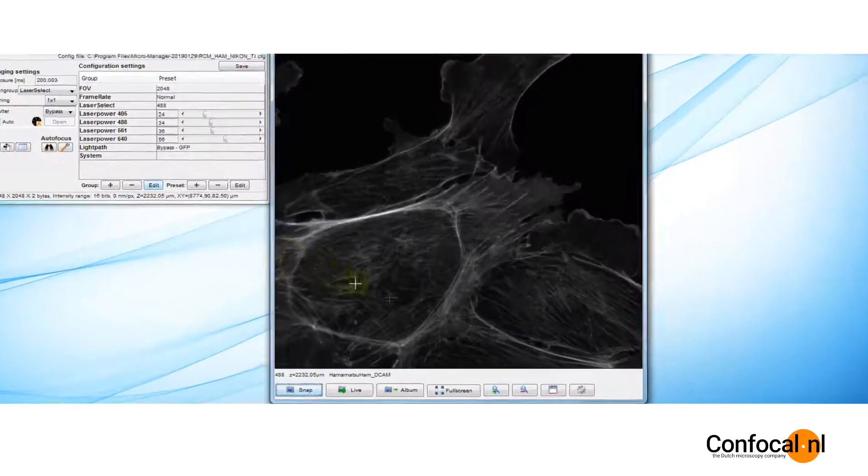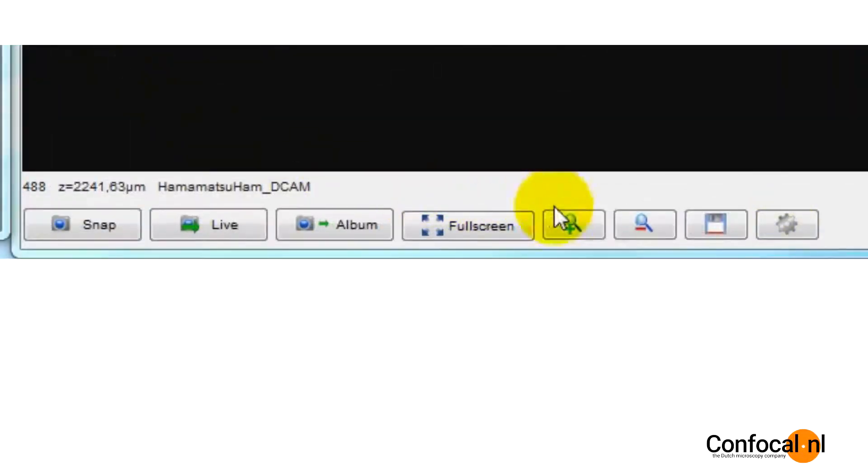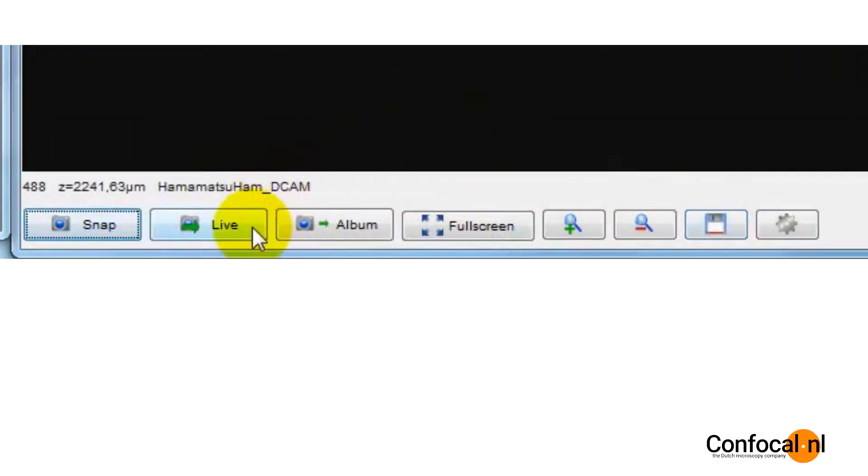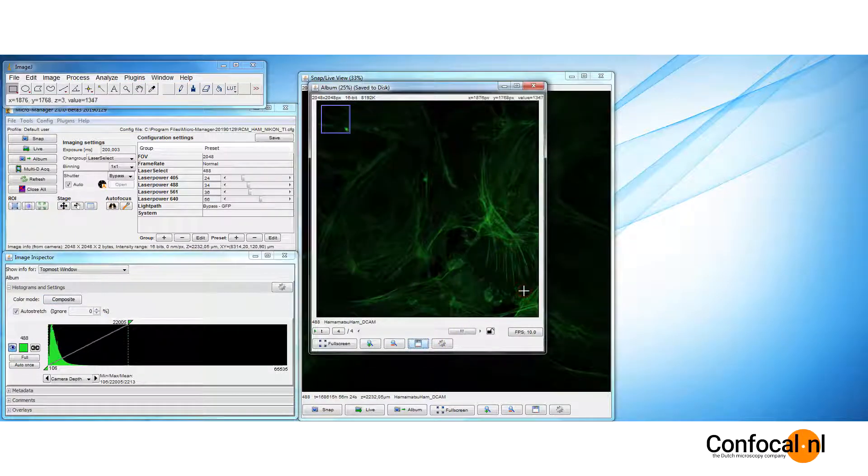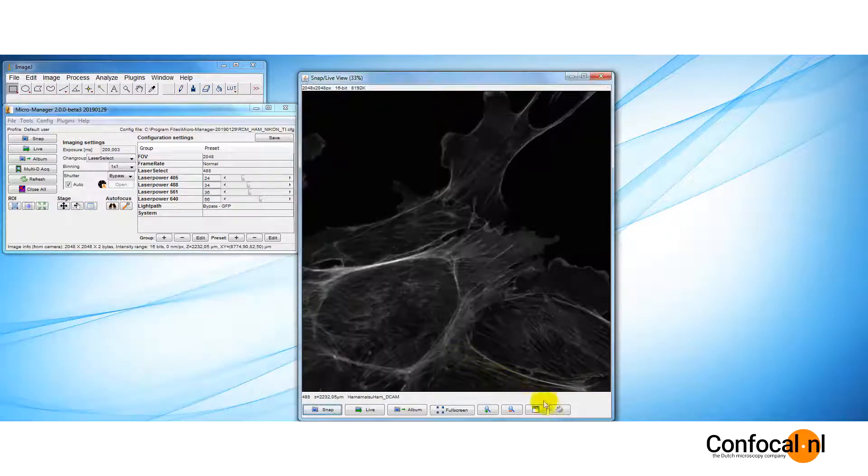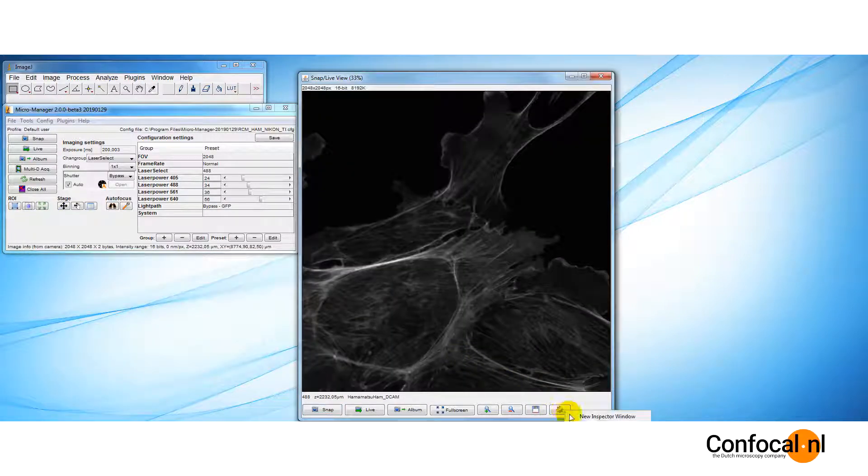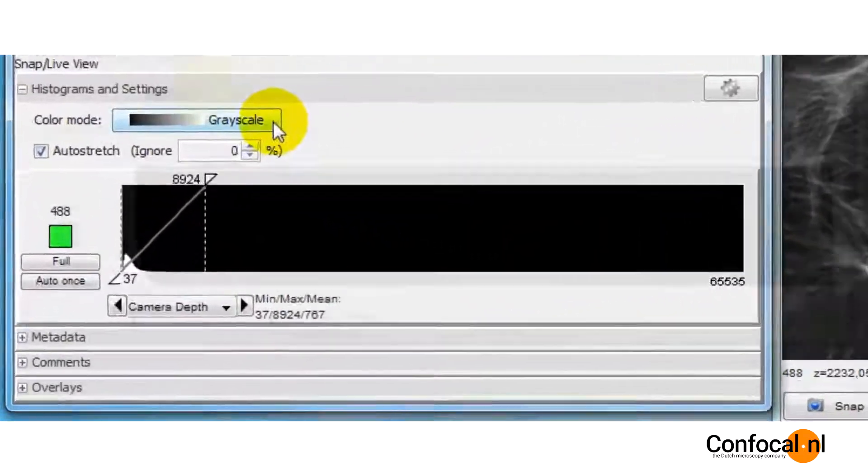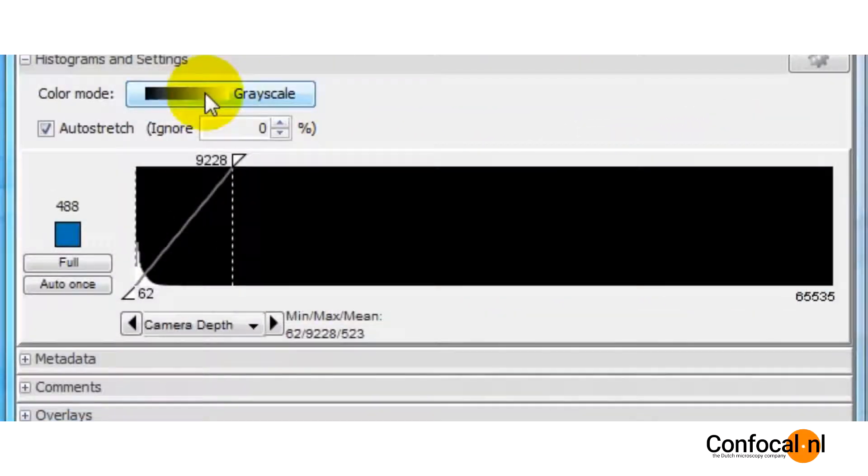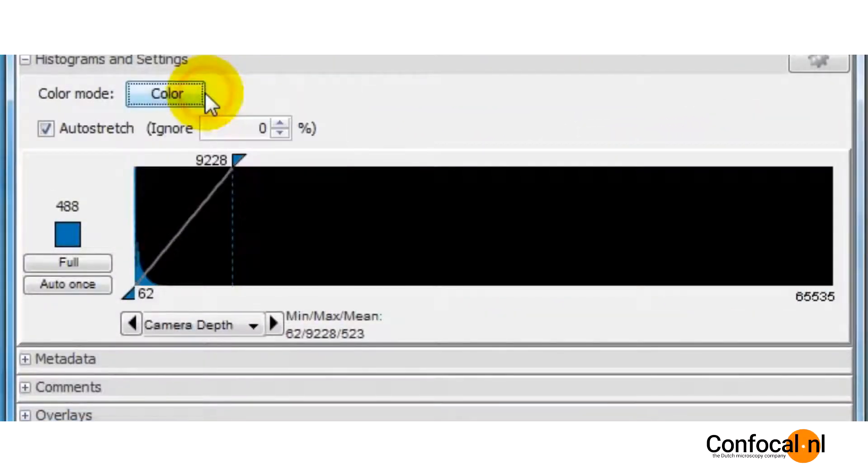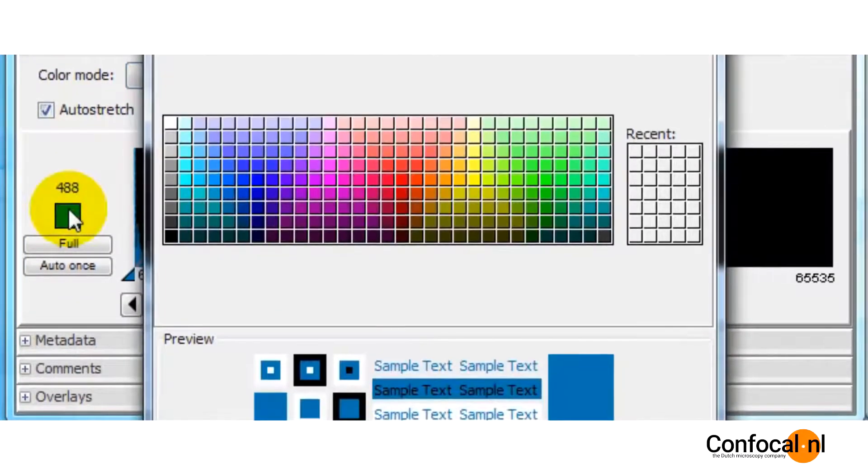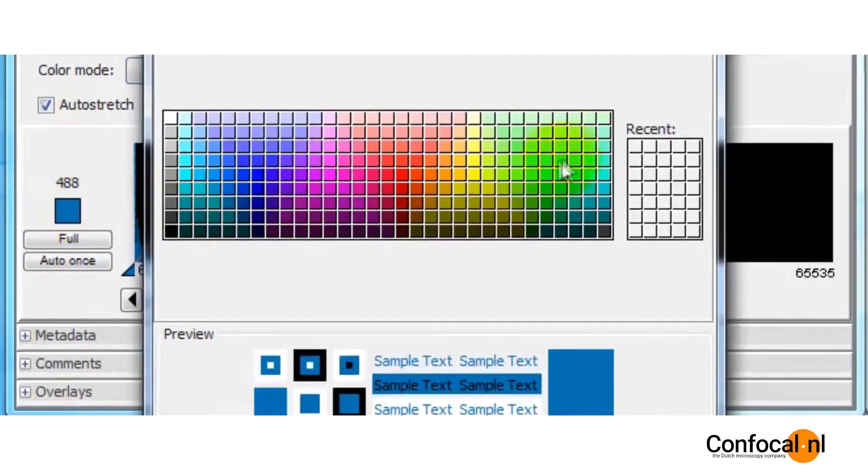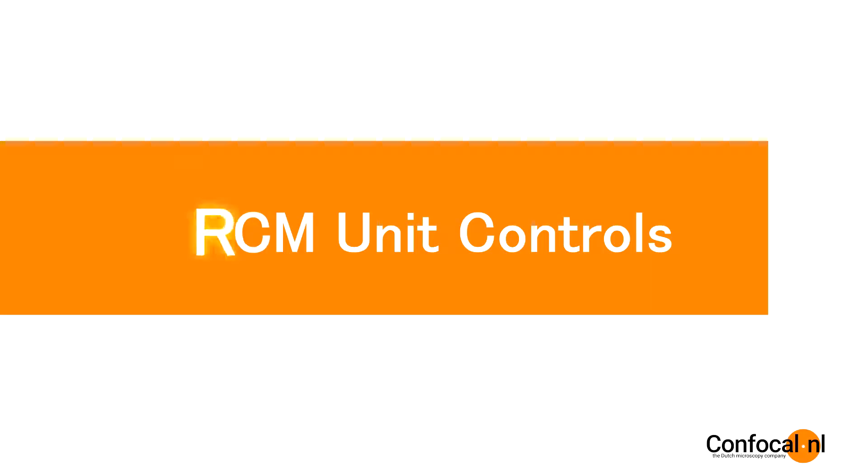In addition, at the bottom of the window, there are shortcut buttons to save the image, enter Live mode or send images to Album. Click the Save button to write all the images in the series window to disk. To assign color or change lookup table, press the settings icon and click new inspector window. Change color mode from grayscale to color. Click the color box to open the color palette and choose your color.